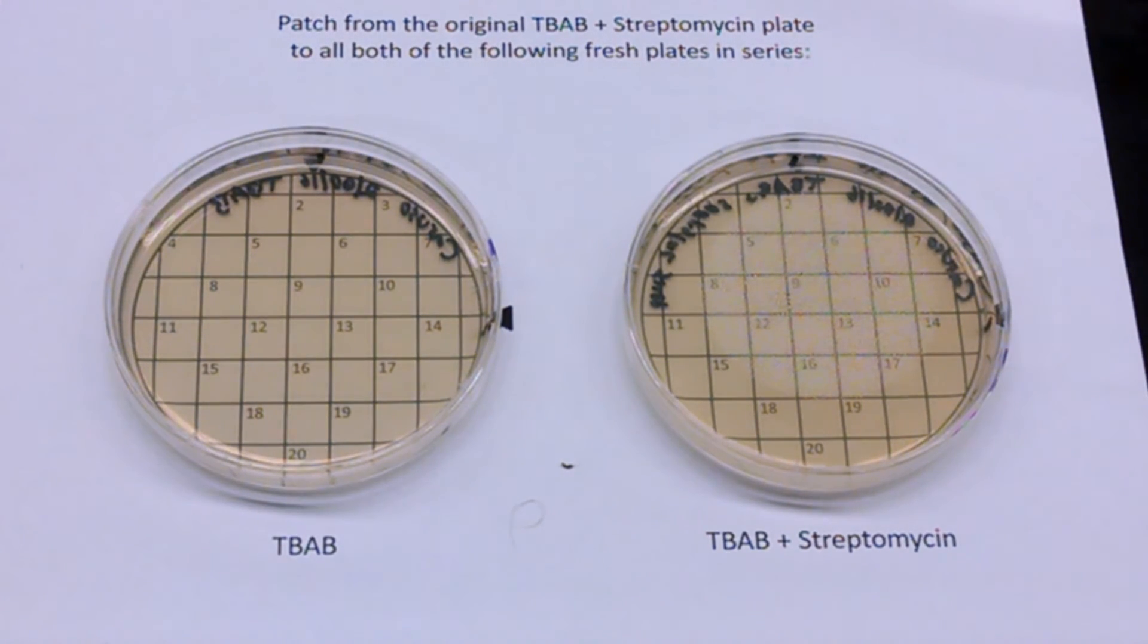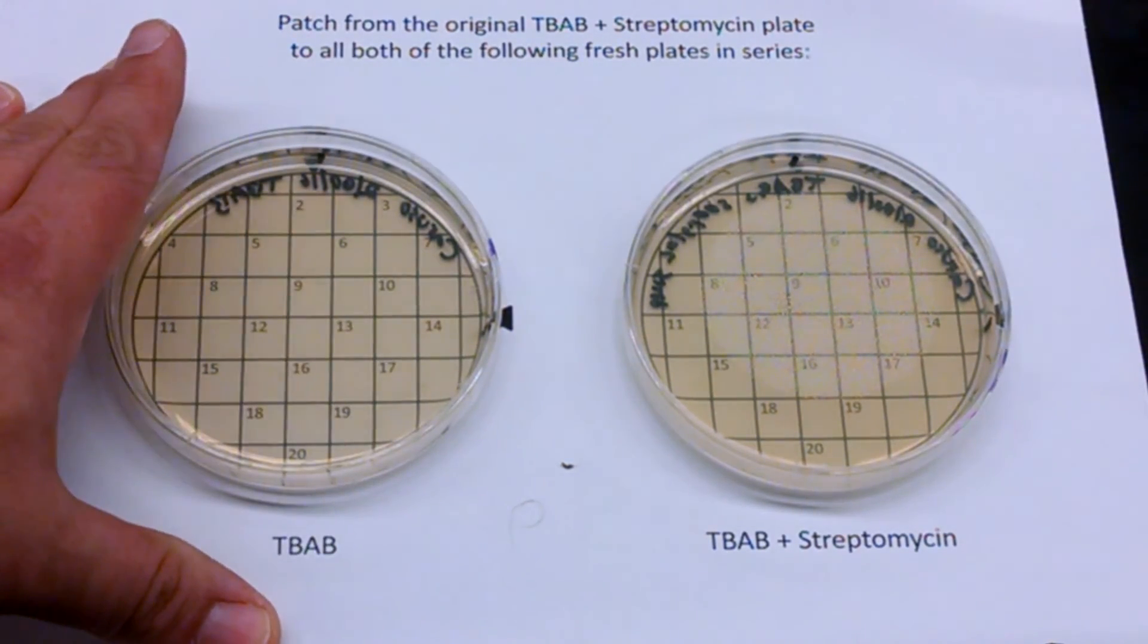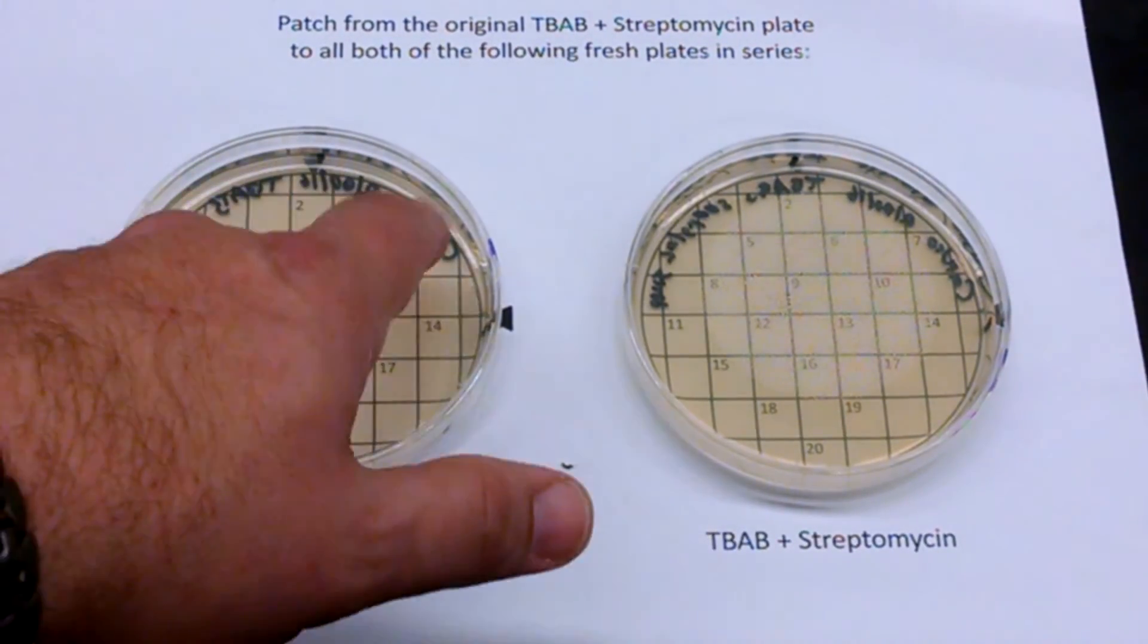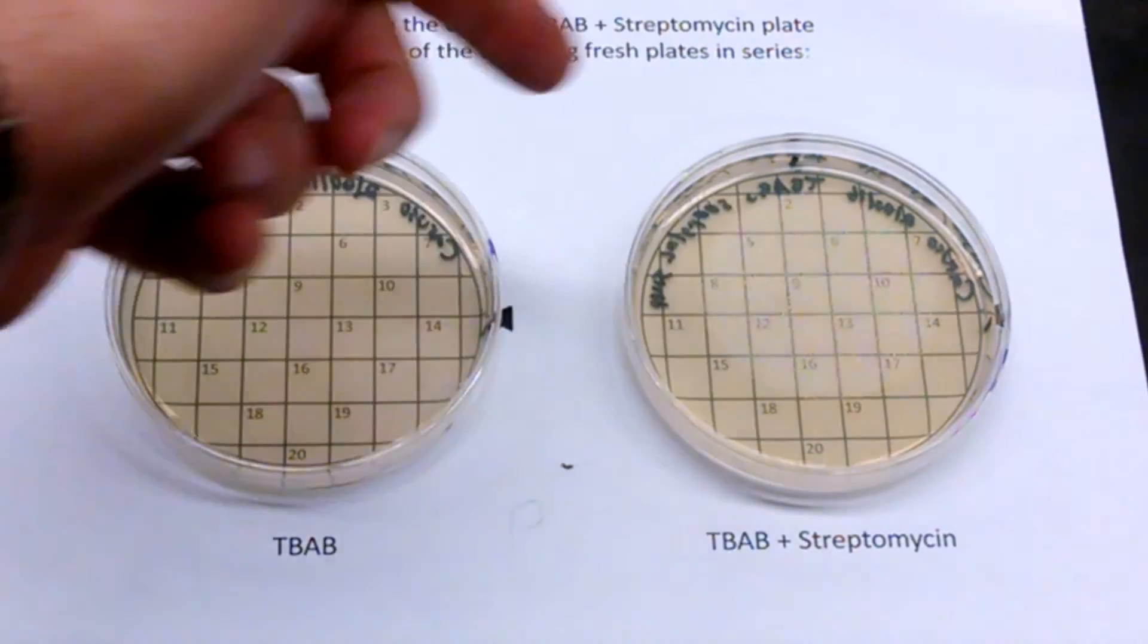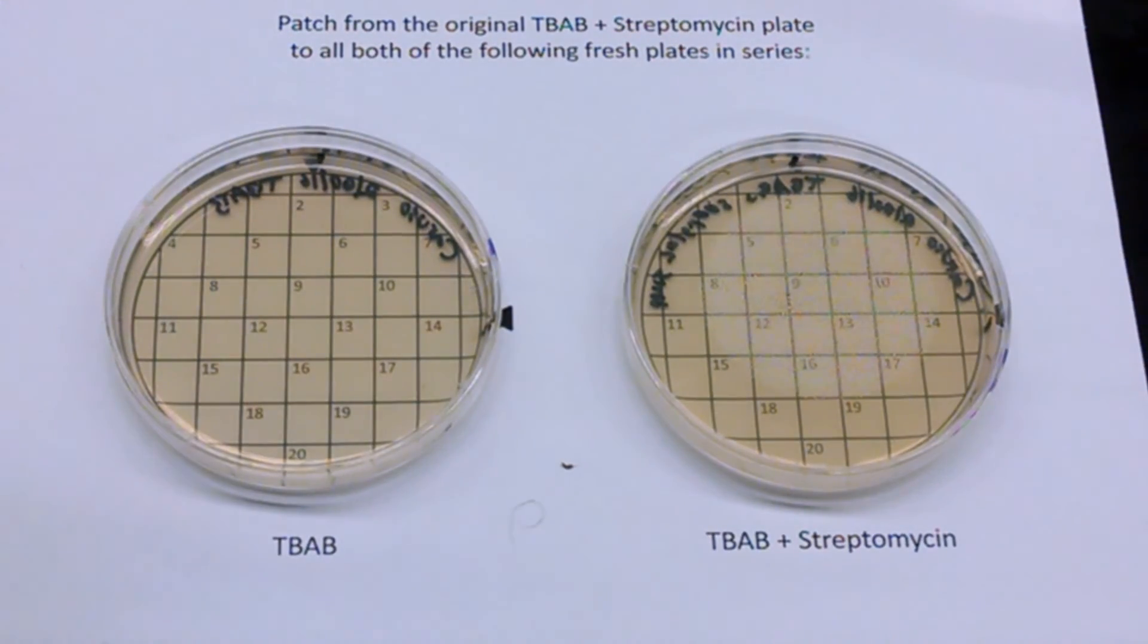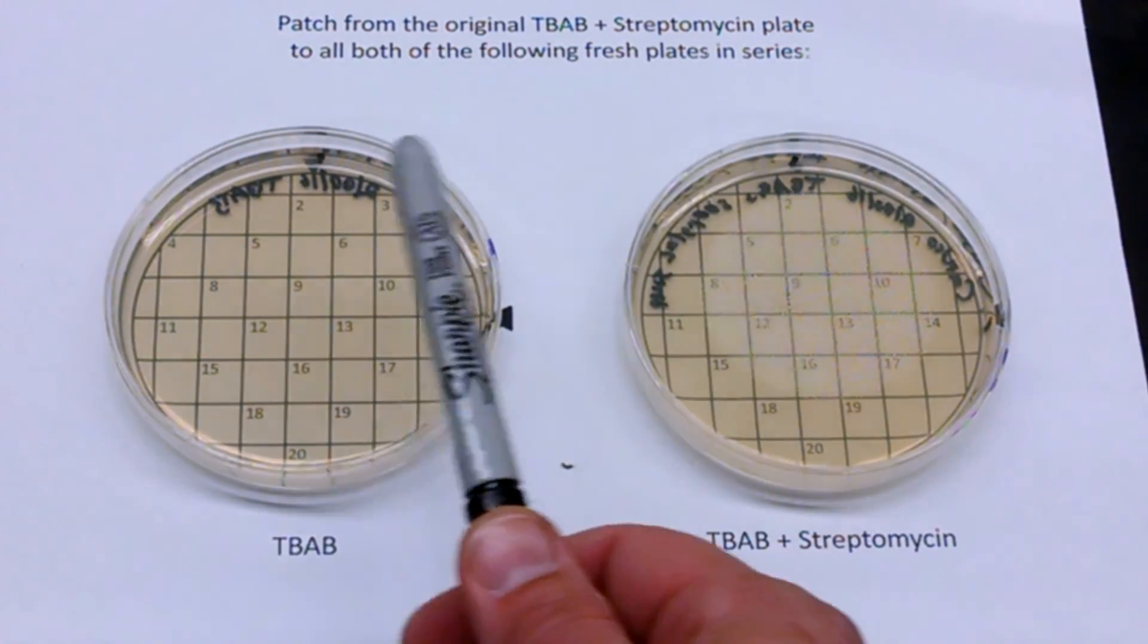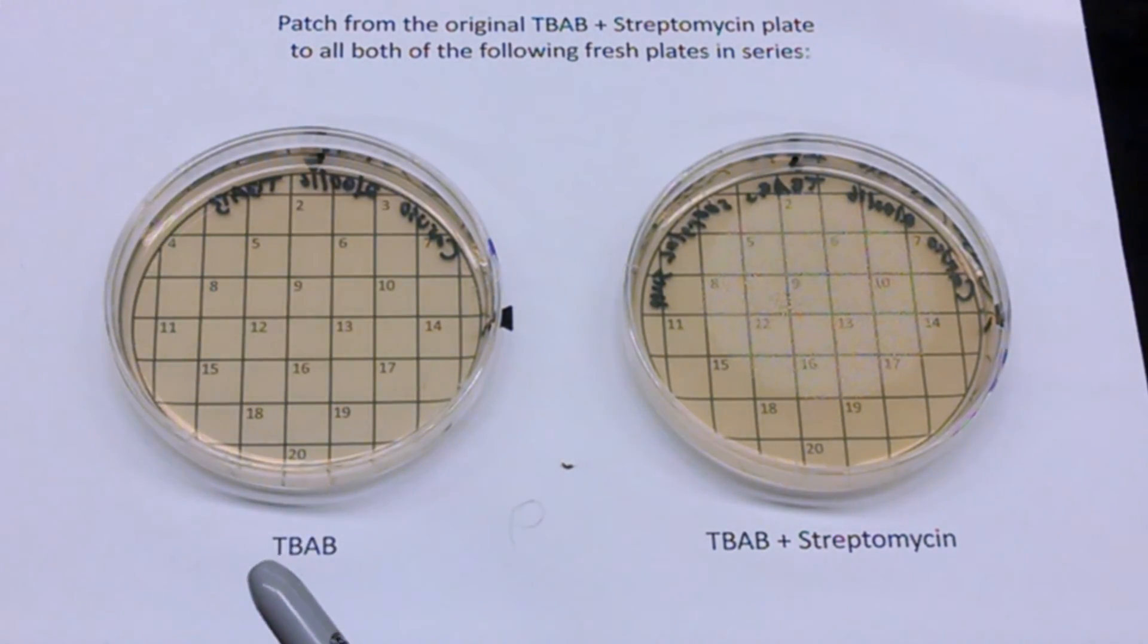Then, the next day when you want to analyze them, you take your grid out. Remember this is in your lab manual. You align the lines, and then you can see the numbers through your plates. And you can compare one to one and two to two because that's the same colony originally. And you make a graph comparing: did it grow on both equally? Did it grow better on one than the other? Better would be a nice, thicker line. If it's a thin line, it didn't grow as well.